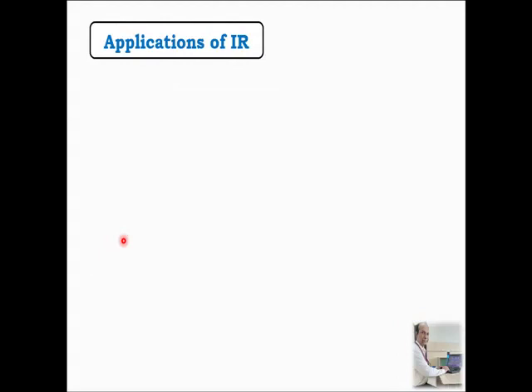Now let's have the details about the applications. The main application of IR is functional group identification, or what we can also call structural elucidation.